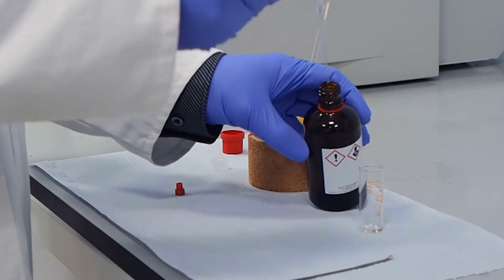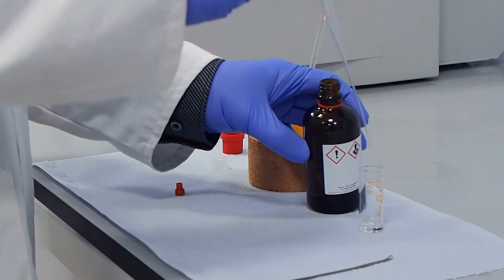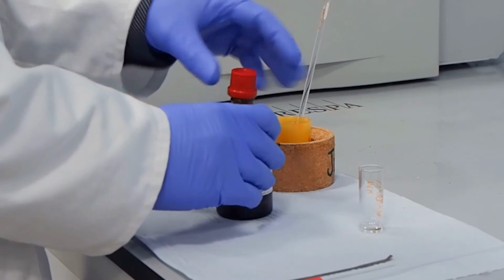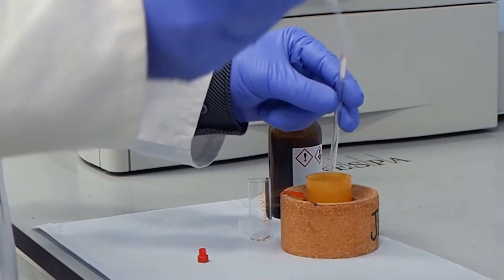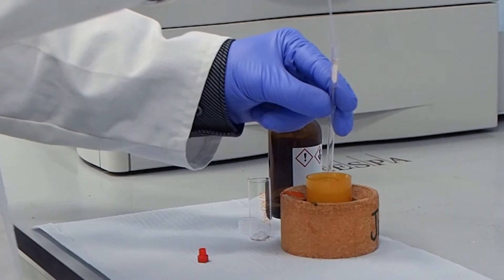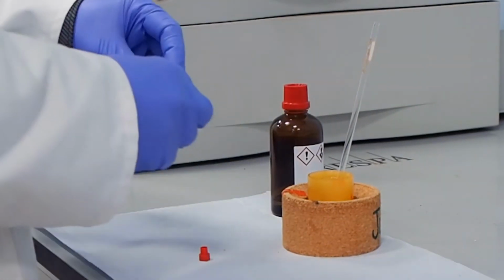He's already got the ethyl benzene in there, and he's adding about 1 milliliter of deuterated chloroform. He makes sure the two have mixed, then adds the mixture into the precision glass of the NMR tube, about 0.7 to 1 milliliter of solution.